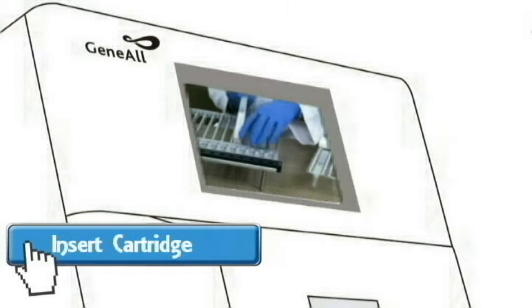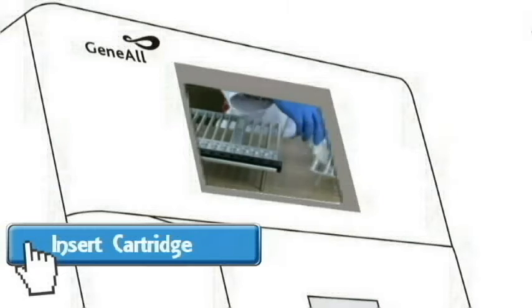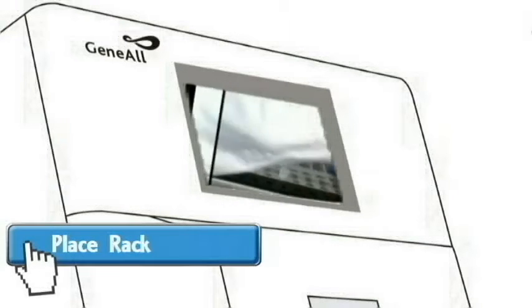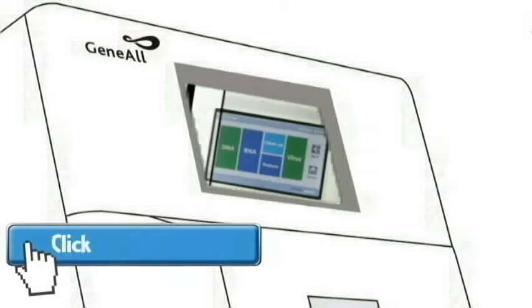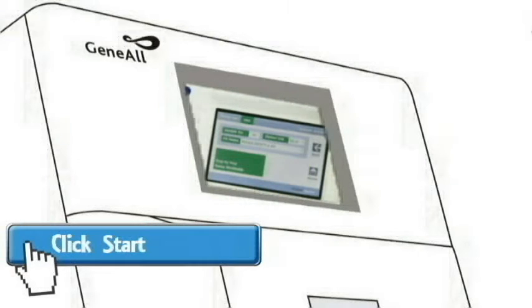Next, remove the cartridge from its package and load onto the rack. After placing all the components, place the rack back inside. Finally, choose from the list of pre-installed setup and press run.